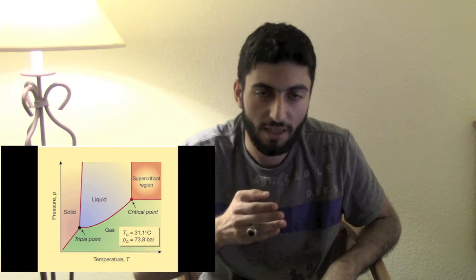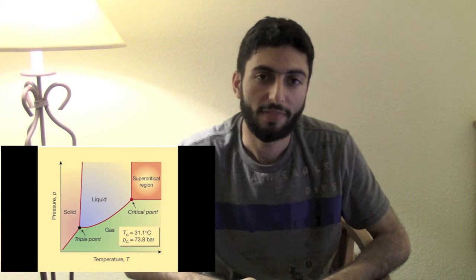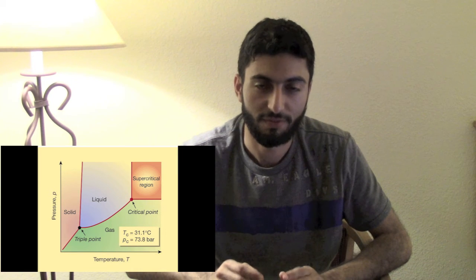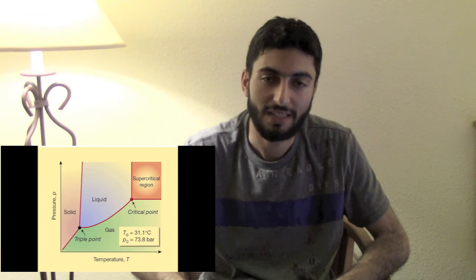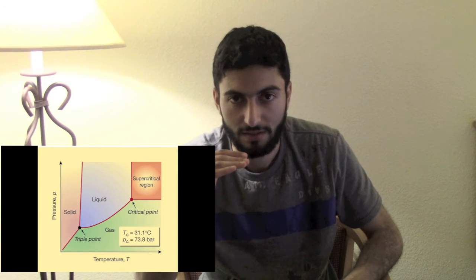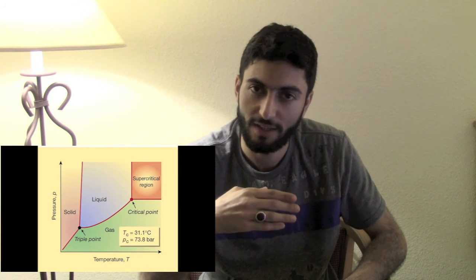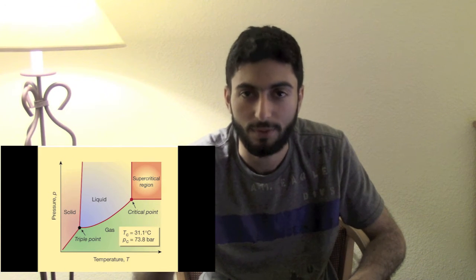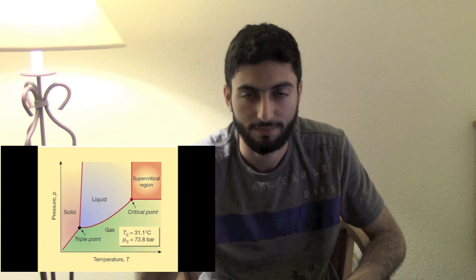If you see in the phase diagram in the slides, that comes the supercritical fluid phase. It comes at a certain temperature and a certain pressure, so that if you increase the pressure and or the temperature after that point, you will be still in the supercritical phase.